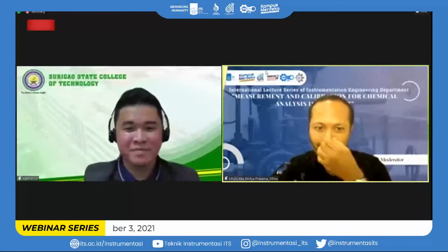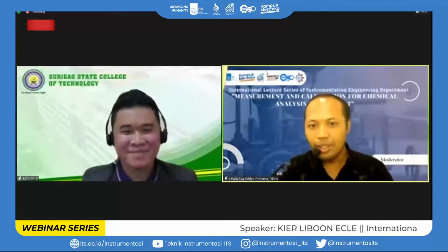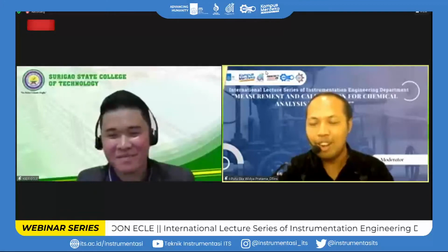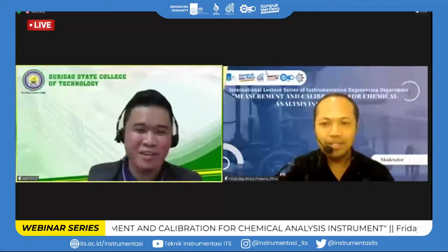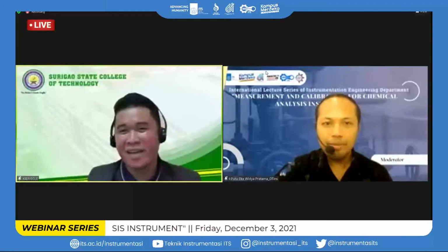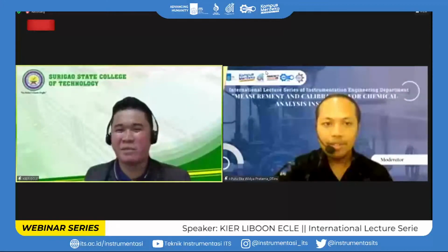In the first one, what are the common errors that occur during the measurement process using UV-visible spectroscopy? Okay, there are a lot of errors. It could be a matrix error, or systematic or random errors that could happen, specifically during the calibration of the UV-visible spectroscopy.